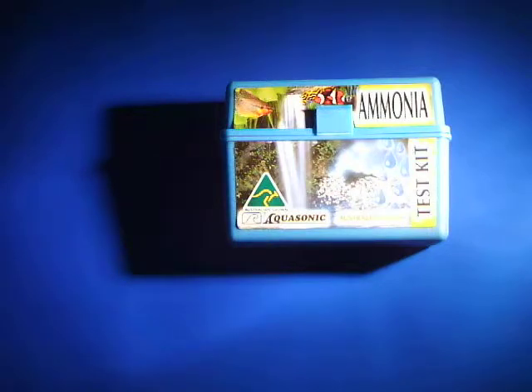It's Australian made, done by Aquasonic — well known within the industry. Great product, ideal for working out how your fish are being treated in their environment. Make sure they don't have exposure to high rates of ammonia where it can cause them to die. This is probably one of the best and easiest test kits to use. Australian made — well worth a try.